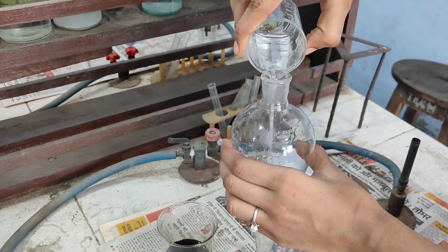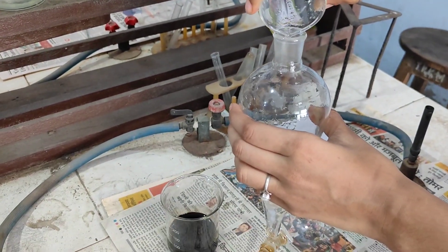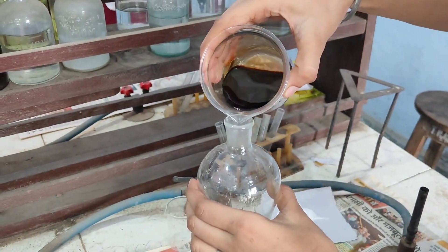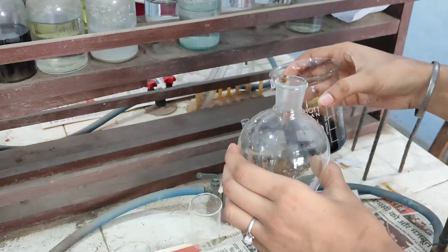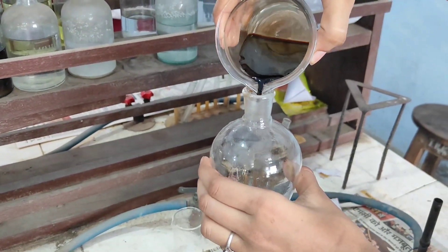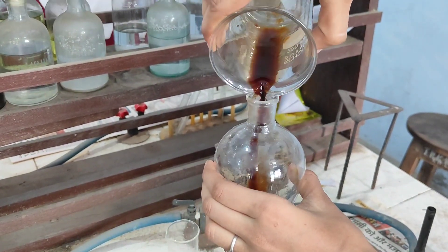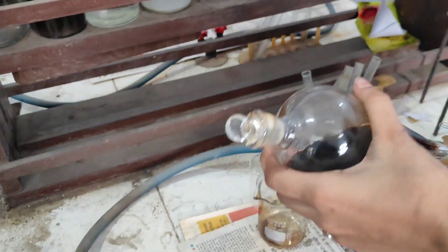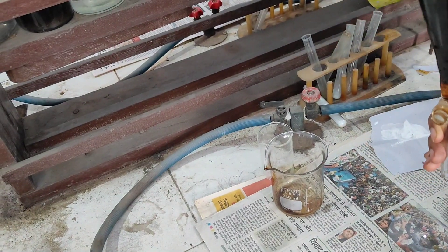We add 5 ml of chloroform into the separating funnel, then add the tea solution into the separating funnel as well, adding the whole sample. After this, we mix both solutions together.